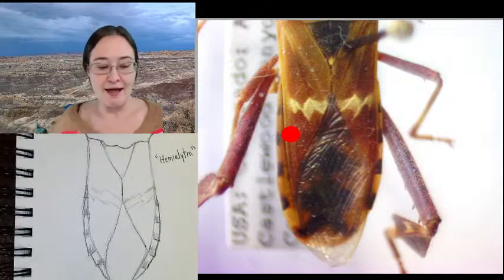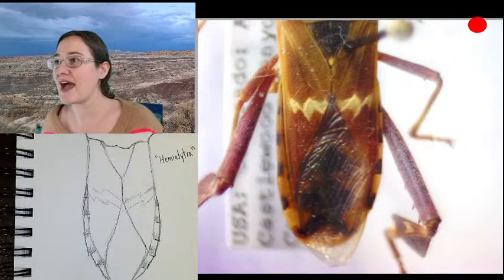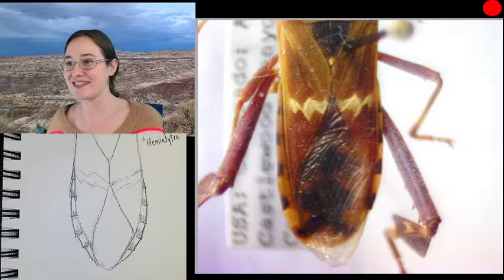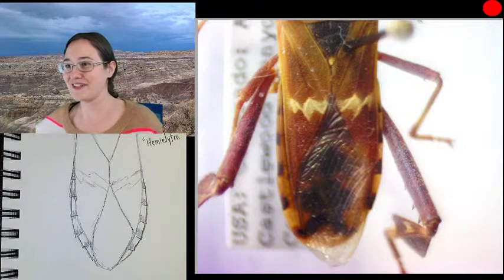All right. So let's see. I think we should zoom in on the wing venation so that we can check those out. I love wing venation. It's one of my faves.